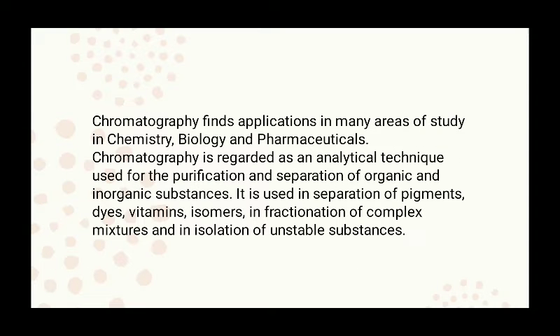Chromatography finds application in many areas of study in chemistry, biology, and pharmaceuticals. Chromatography is regarded as an analytical technique used for purification and separation of organic and inorganic substances. It is used in separation of pigments, dyes, vitamins, isomers, fractions of complex mixtures, and isolation of unstable substances.